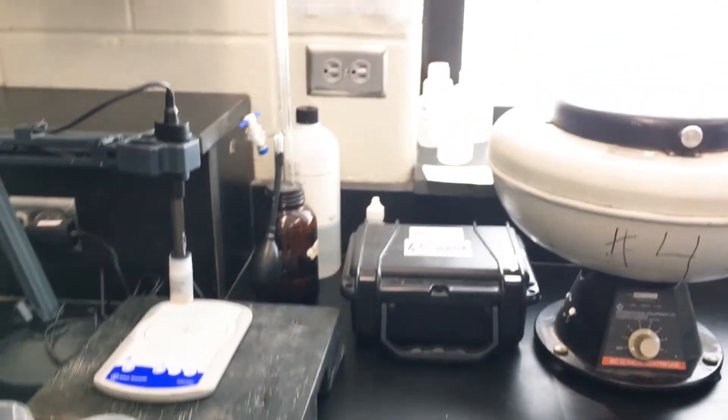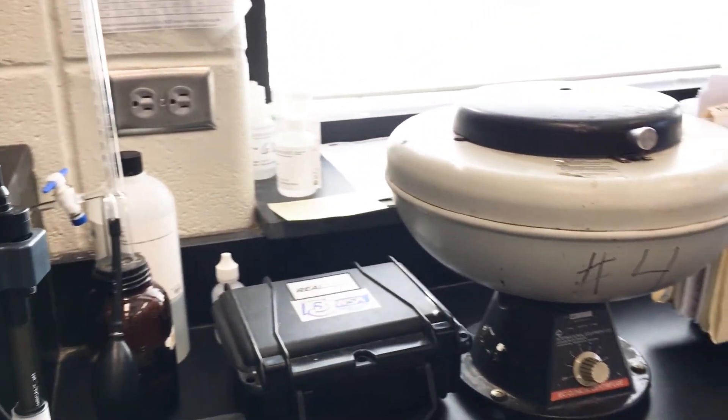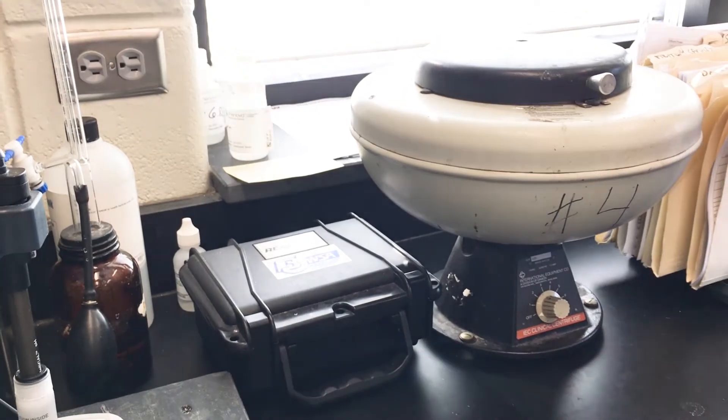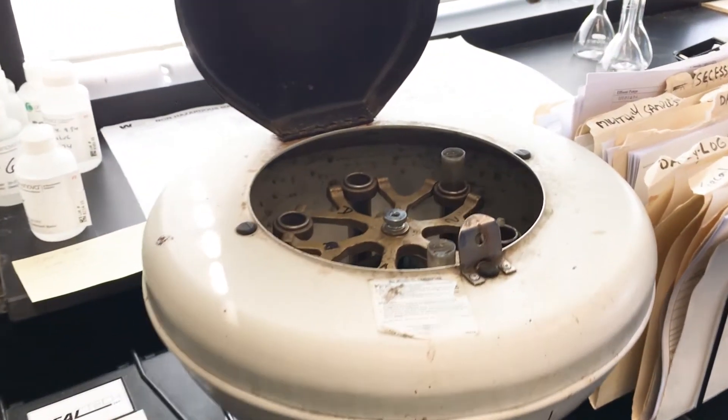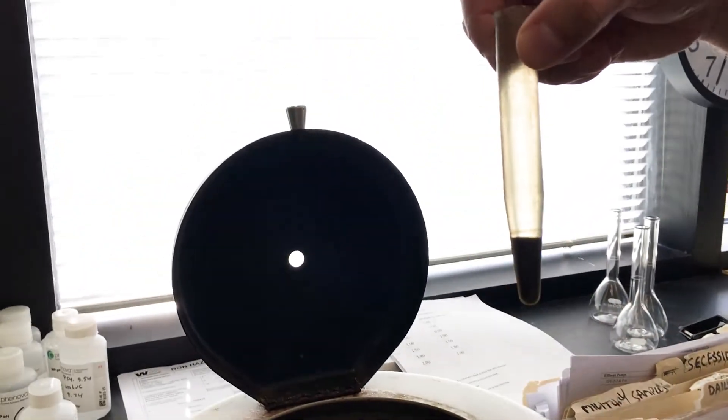This is our centrifuge. This actually spins a mixed liquor. What we'll do is we'll put in the floc that you saw those bacteria in and we'll spin it and we'll be able to get a reading — that's how much bacteria you know you have in the plant.